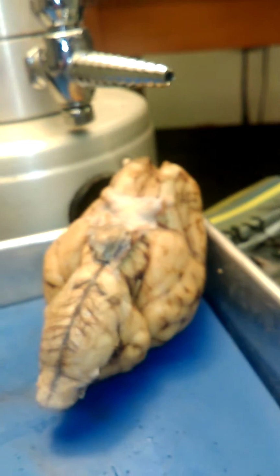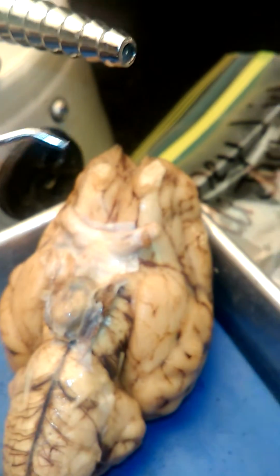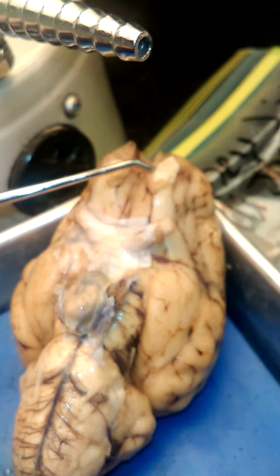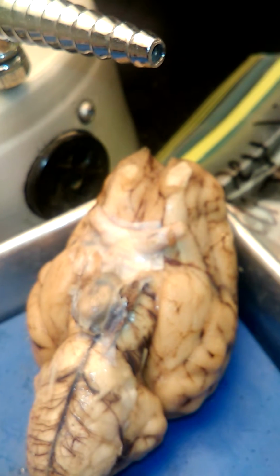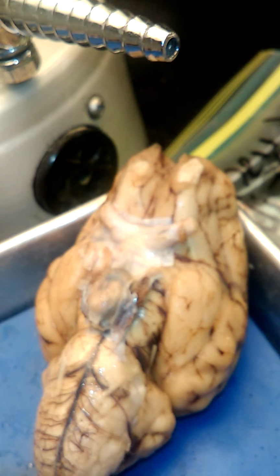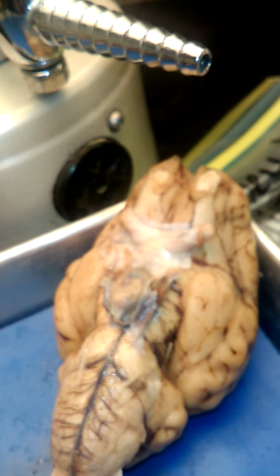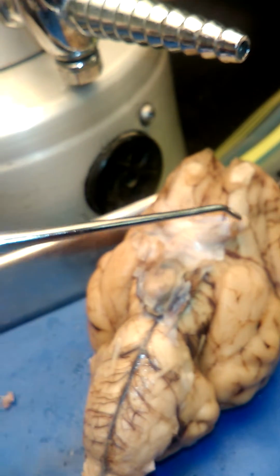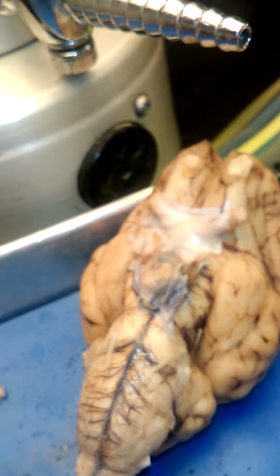We're going to look at 6 out of the 12 in this sheep brain. Okay? The first nerve we're going to look at is this nerve here and this nerve here. They are called the olfactory nerves, which is the first nerve, number 1 nerve. And then we have this one and this one. These are called the optic nerves.